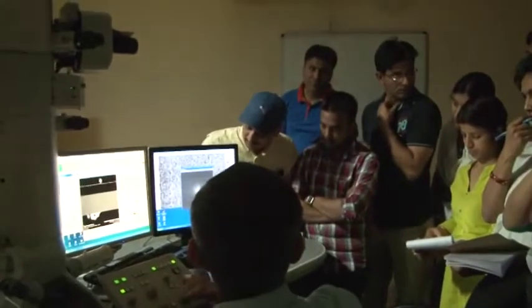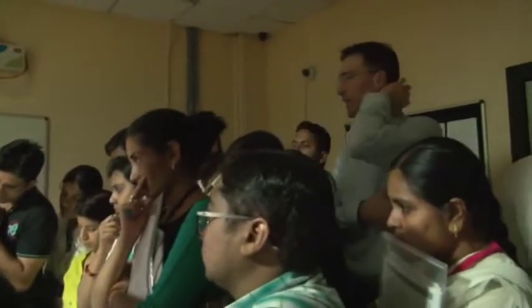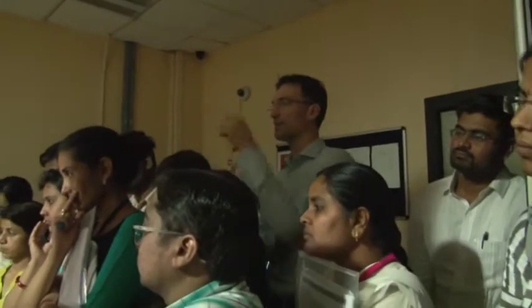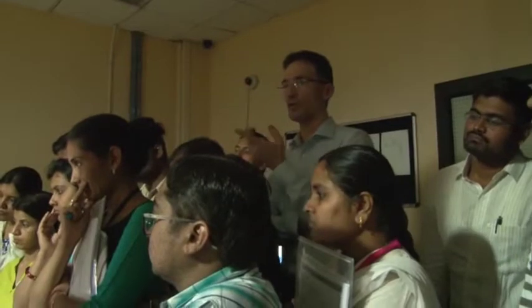More away from focus, it doesn't matter. Now we come closer to focus. This is far, so the structures are coarse, and if you get closer and closer to focus, the structures get finer, and the rings disappear in the Fourier transform. You see that? And if you go from under to over focus, those rings will come up again.